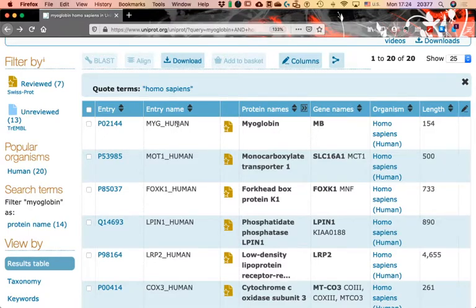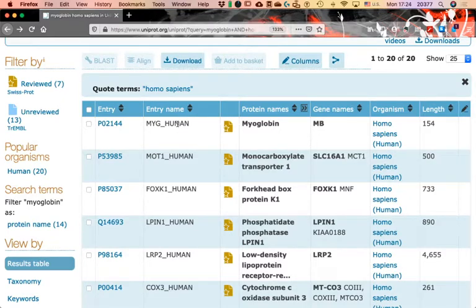Go into the Columns menu, go to the bottom of the page to 'Databases,' and get the PDB. There are going to be two other options — SMR — don't click on those. The PDB sum is actually quite an odd interface and probably not as useful as others for 3D structure. So: Columns, then 3D Structure.